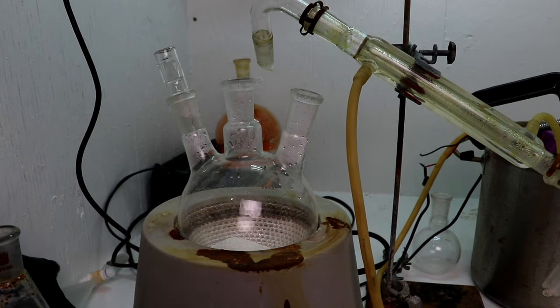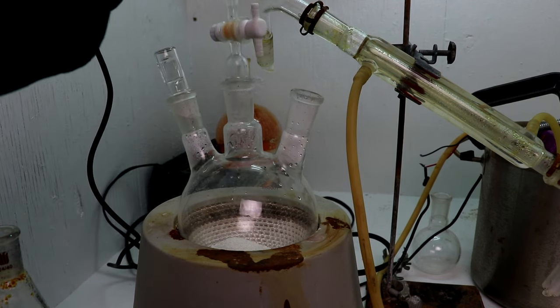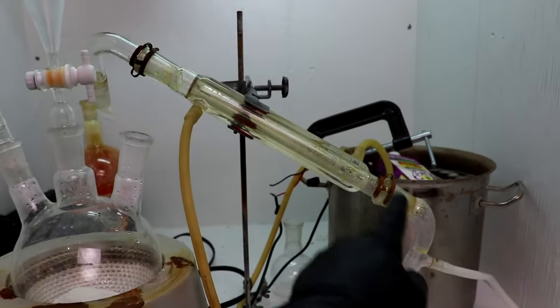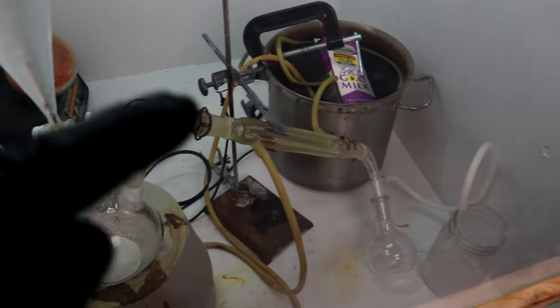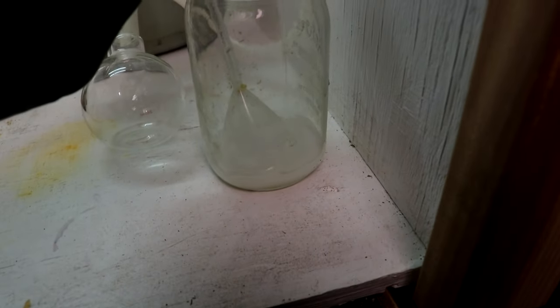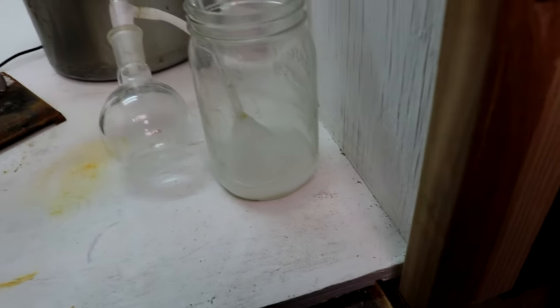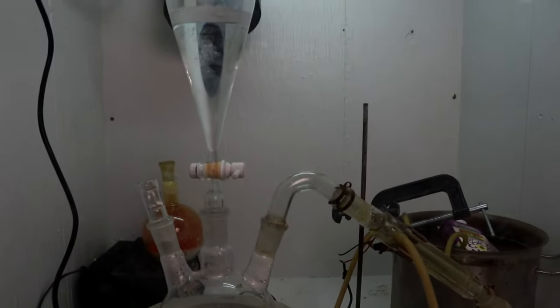So let's reattach all of my distillation equipment. I'm going to put a dropping funnel up on top here. That's where I'm going to put the hydrobromic acid. And we should get bromine distilling over. Okay, we're just about ready. Distillation apparatus is set up. We've got a bottle of frozen milk in the cooling water to keep it cold. We've got a scrubber with some sodium hydroxide here to catch the bromine vapors. But of course, I'm also doing this in a fume hood, so anything that doesn't get caught will just get sucked right outside. So here we go.